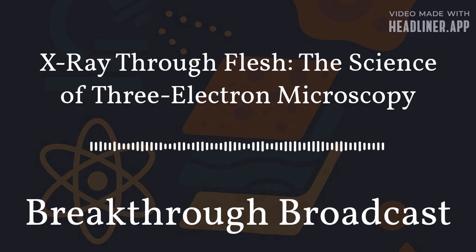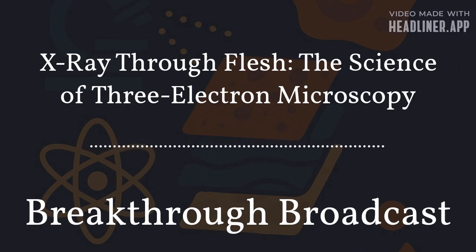Three-electron microscopy brings these three different types of signals together using synchronized detectors and precise alignment algorithms. The microscope records all three electron interactions in real time, then combines them into a single composite image. The beauty of the technique lies in how the data integrates.